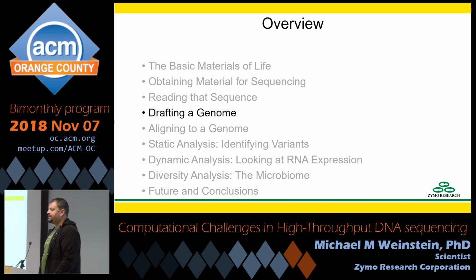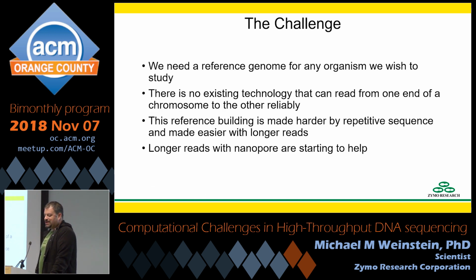Okay, so this is where I get from the hardware now into the software. This is the part I think everybody probably really wants to see. So what's the challenge here? We need a reference genome. For pretty much any organism we want to study, one of the first things people will try and do is come up with a draft reference genome for it.